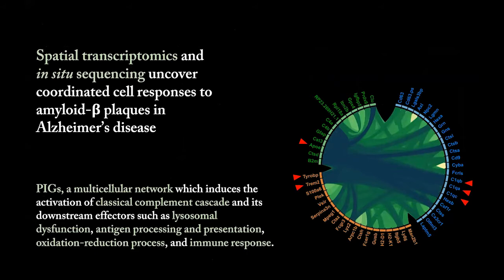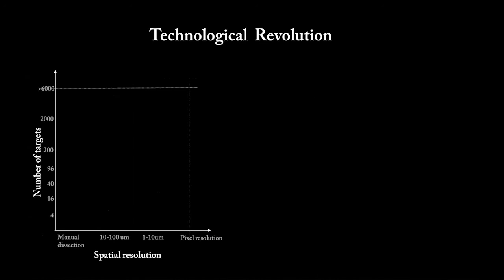Before I move on to our current progress, I would like to highlight that the technology has evolved extremely fast during the past 3 to 5 years. Here I try to summarize the technologies based on their spatial resolution and throughput. And beyond those two properties, I will also summarize what other properties might be important for biological applications.